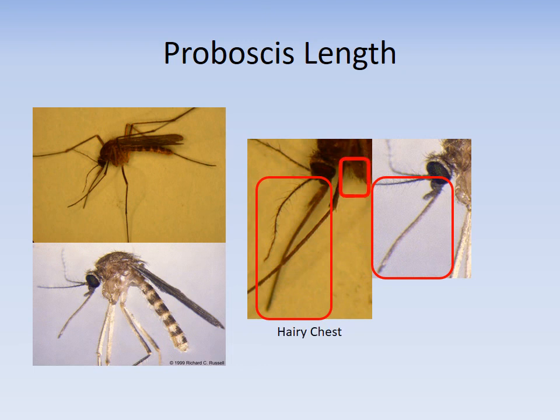Also, another characteristic that's not talked about is the hairy chest. If you're trying to decipher between a Melanura and a Culex, and that length of the proboscis is just hard to figure out, and you can't find the armpit hair on the wing, the Culiseta melanura has a much hairier chest here, lots more setae coming off than a Culex does, if that's a benefit to you.